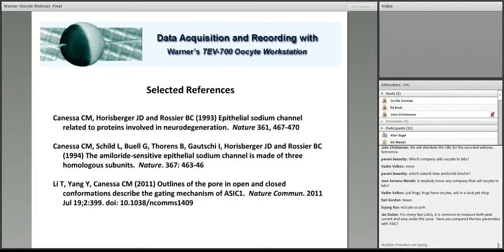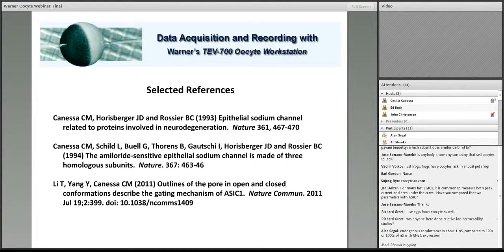When you have endogenous currents, are there proven techniques for controlling those currents so you don't have overlap with the expressed channels? Actually, there are. People that have been working with oocytes for a long time learn to know what is in the membrane of oocytes. And I can tell you there are very few water channels, almost none, so you can change the osmolality of the solution for relatively short periods of time, and maintain a perfect stability of the cell.